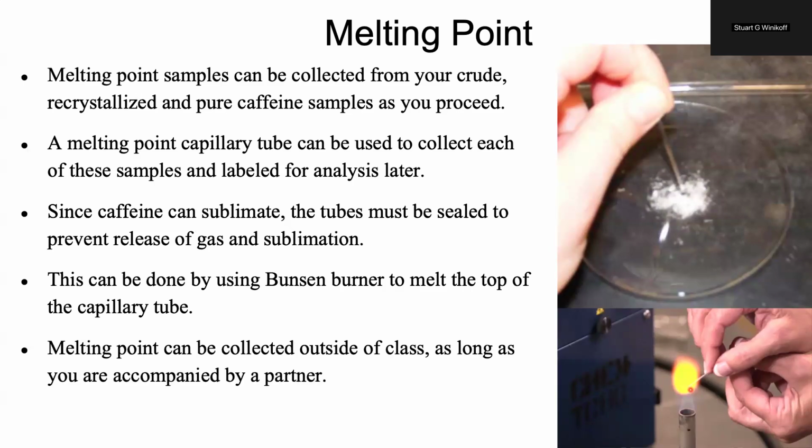Now, one of the big things is oftentimes by the point you have all of your tubes made and everything else cleaned up and packaged, we're usually at about the end of the lab. So oftentimes we're going to encourage you to collect your melting points outside of class, because these can take 10 to 15 minutes to collect.